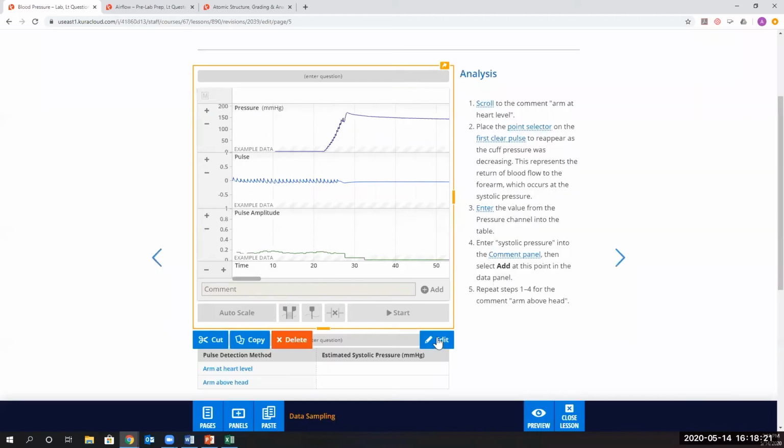As soon as you do that, you'll be able to use that example data that you've personally recorded from LabChart in LT. And I'd be happy, Kristen, to go over it with you or make another video when I actually have a data file, but I apologize, I don't have one on here right now. Okay, are there any other questions before I move on to some of our newest features?